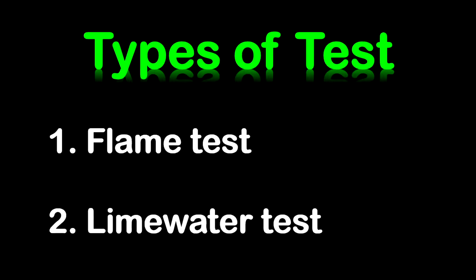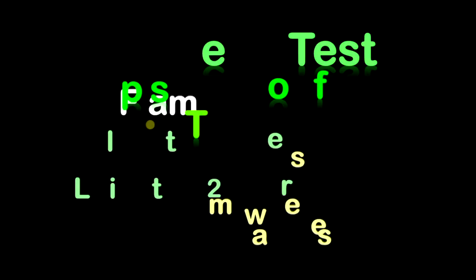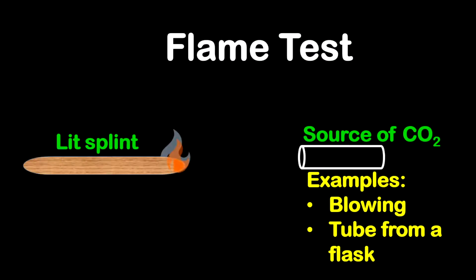Now let's go into the flame test first. For the flame test, you notice on the left of your screen there is a lit splint, and on the right of your screen there is a source of carbon dioxide. Now this source of carbon dioxide could be blowing, which includes exhaled air, or you could simply connect a tube from a flask which will contain a reaction that is producing a gas.